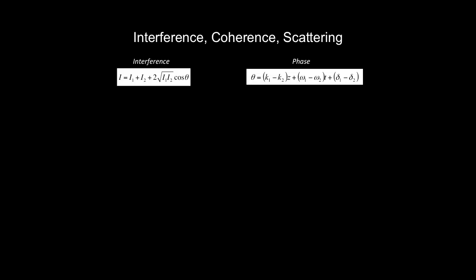We mentioned how important this focal point is when we focus the light into the specimen. It's important to focus the light tight, but it's also important to maintain this tight focusing during light propagation in the specimen. I'd like us to go over the factors that affect the size of the focal point as the light propagates in the specimen.